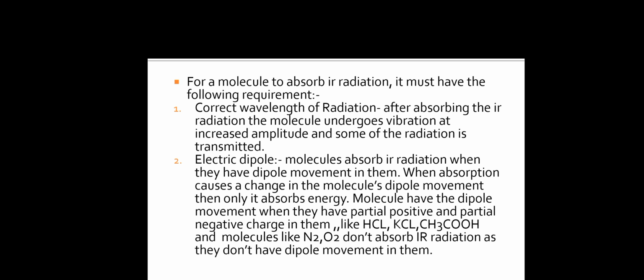Now the second quality it must have is electrical dipole moment. So molecules absorb IR radiation when they have a dipole moment in them. That means partial positive and partial negative charge in them. Such molecules react with the IR radiation, absorb the energy, and undergo vibrational changes. Molecules like HCl, KCl, and acetic acid have a partial positive and negative charge in them. That's why they interact with the IR radiation and absorb it. And molecules like N2 and O2 don't absorb IR radiation as they don't have any dipole moment in them.